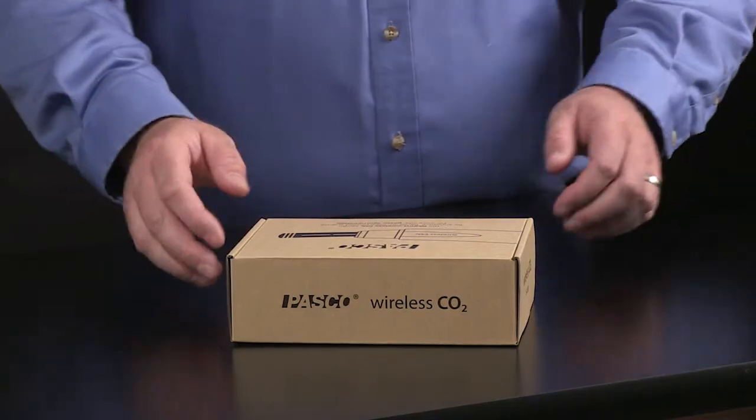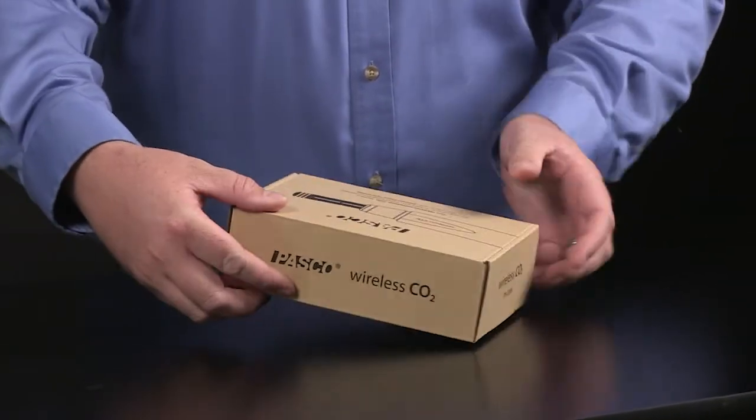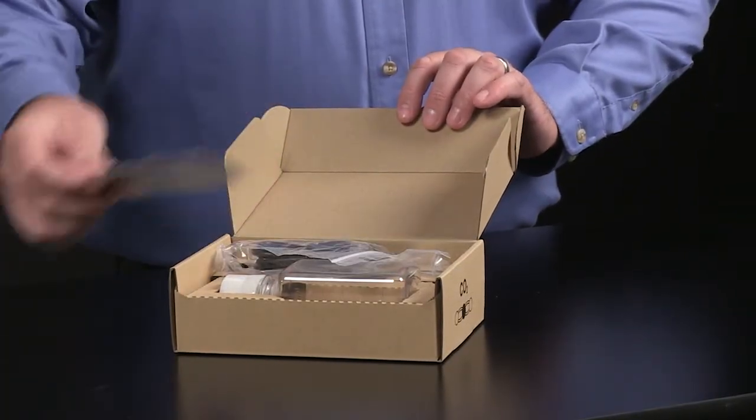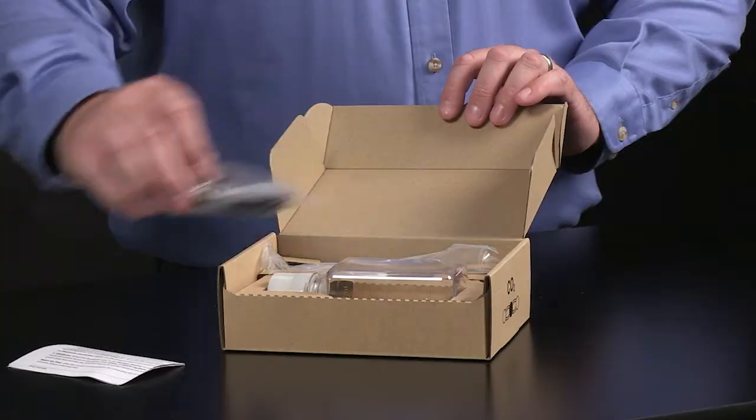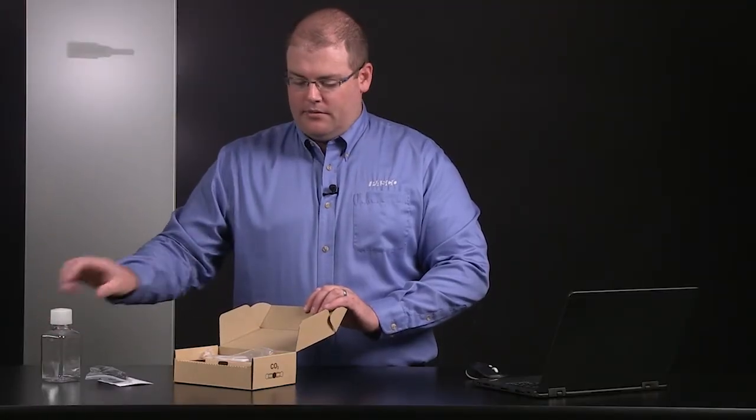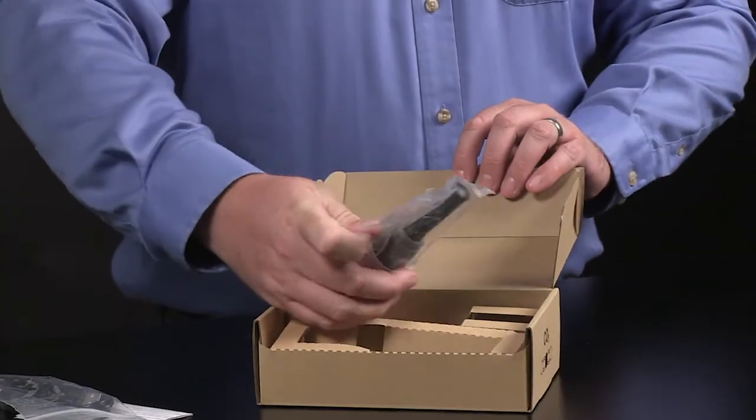Let's go ahead and see what's in the box. We've got an instruction sheet, a USB cable, 250 milliliter sample bottle for common experiments, and the sensor itself.